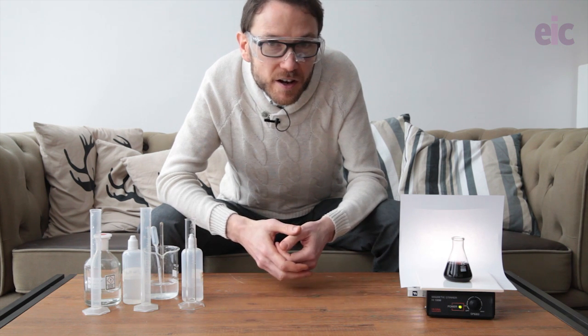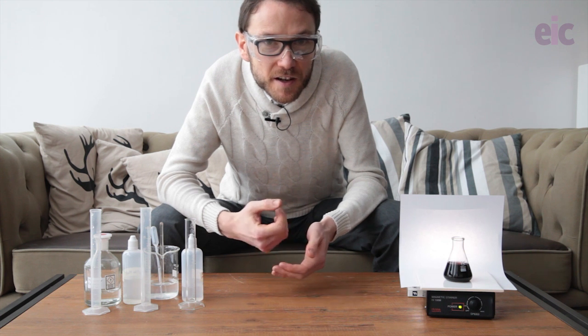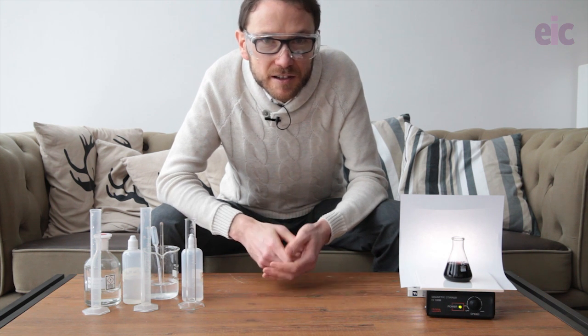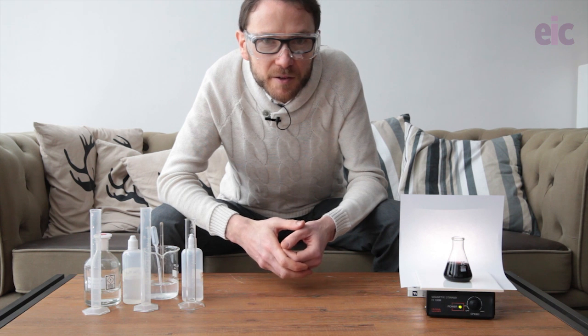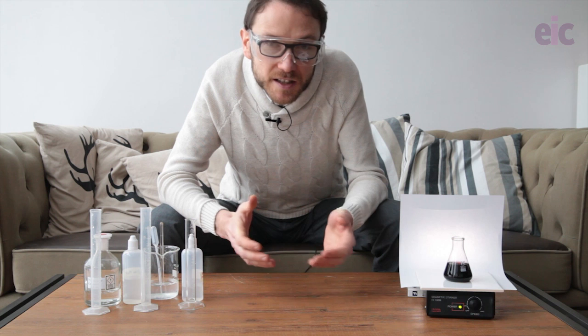So there you have it - the Briggs-Rauscher oscillating reaction. A staple of chemistry demonstrations for very good reason. Absolutely fascinating for students to look at and really beautiful to watch. Give it a try. Bye.